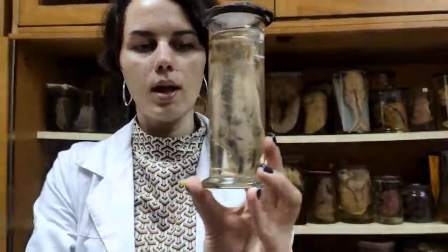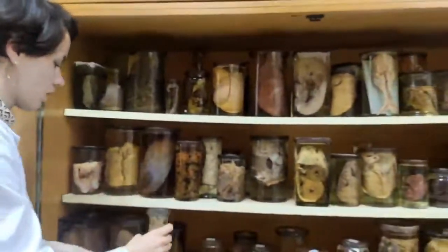That means that during traumatization by food, for example, or chemical factors, these veins can be injured, and the patient can develop severe bleeding. And sometimes the cause of death is massive blood loss in these patients.